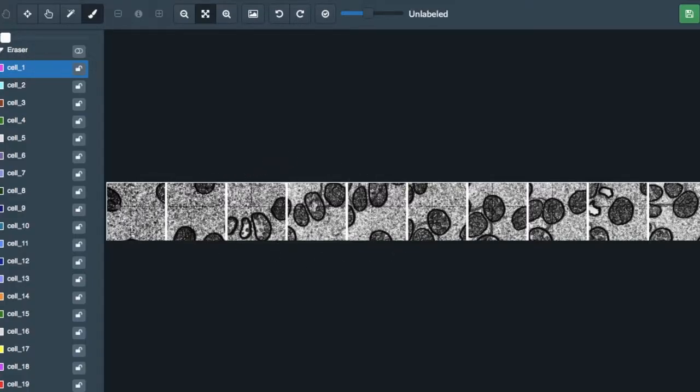Here is an example of the type of image you will be asked to annotate. Each panel is a snapshot in time, which progresses as you move from left to right. One thing to remember is that as these images are a progression through time, cells might change position between panels. Not only that, cells may also be moving into and out of the screen, resulting in an increase and then a decrease in clarity and intensity of the cells. Because of this, you're going to have to keep track of which cells are which.